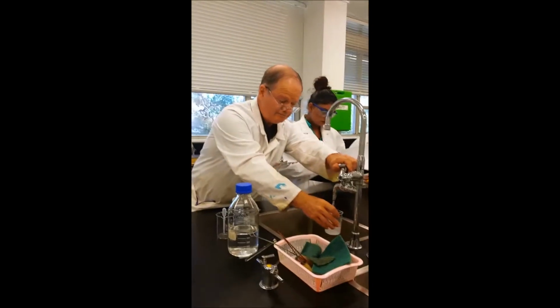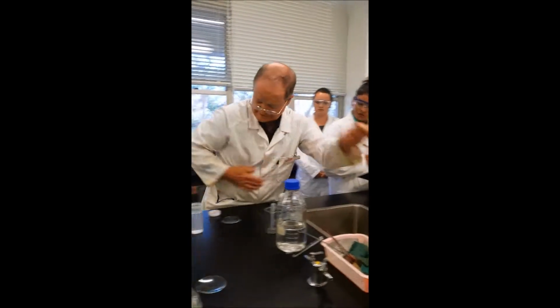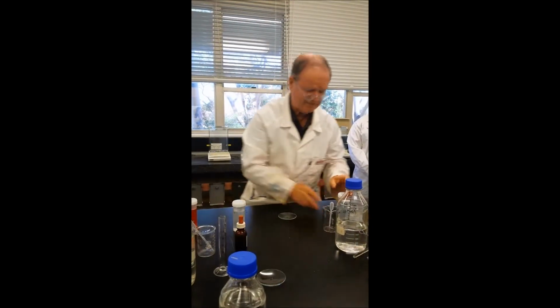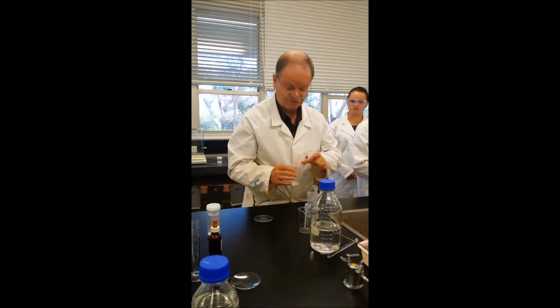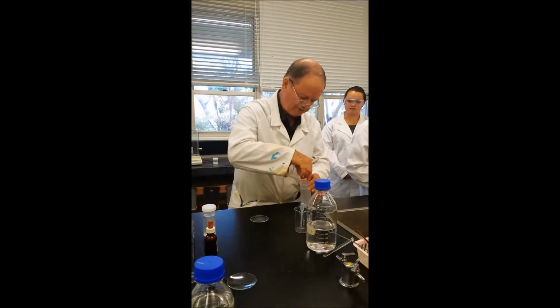All right. And of course you're going to get problems because all these other people want to use the balances before you, don't they? And you're all pushing against each other and working against each other. That's right, all out for yourselves. That's the way it goes. Okay, there goes the starch.